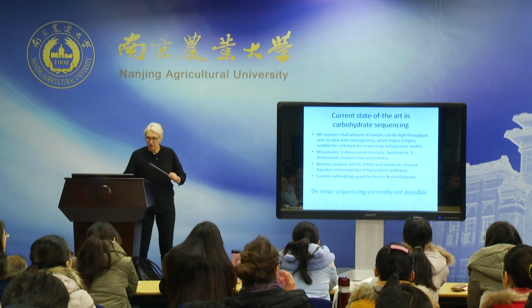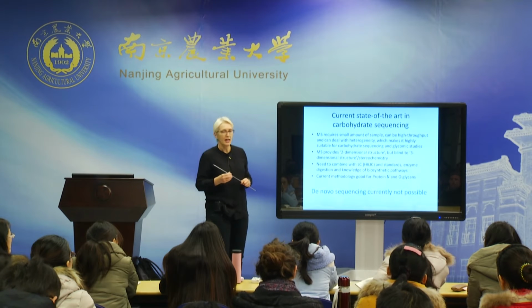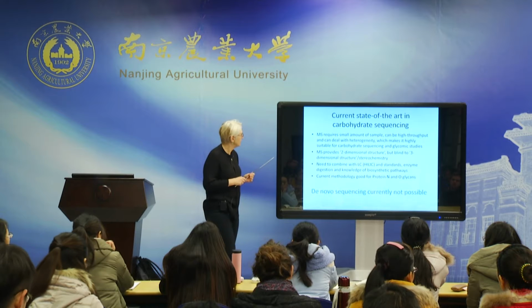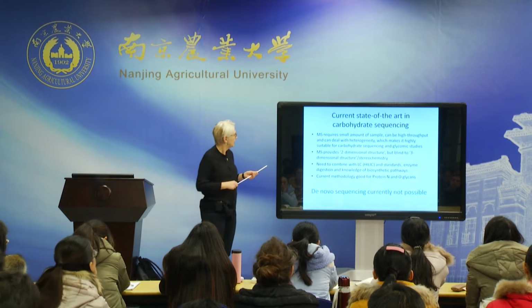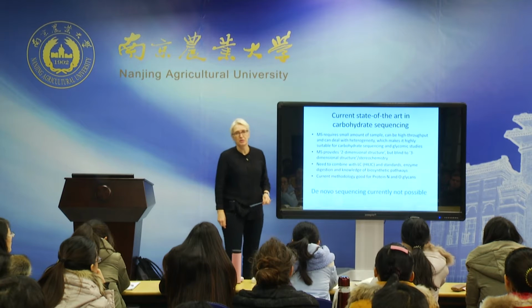So if you look at the current state of the art of carbohydrate sequencing, as I said, it's not our work, but the stuff I've been talking about, mass spectrometry I think is the way to go, combined with an ancillary method, because it really requires only small amounts.